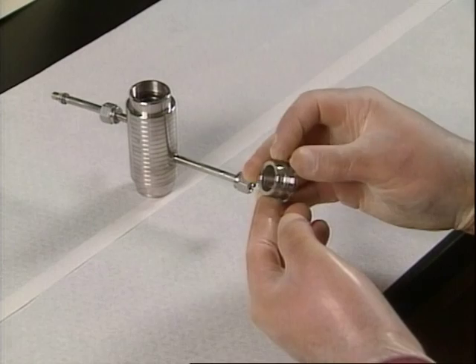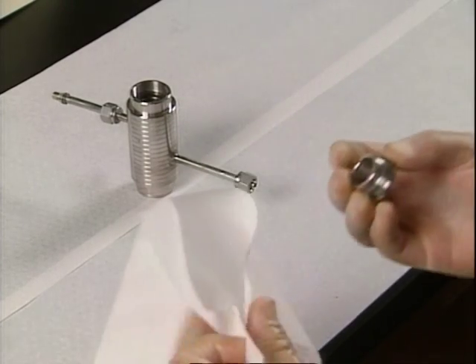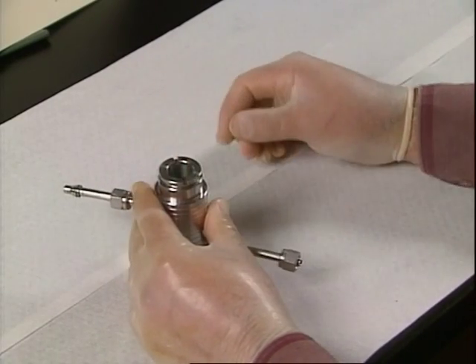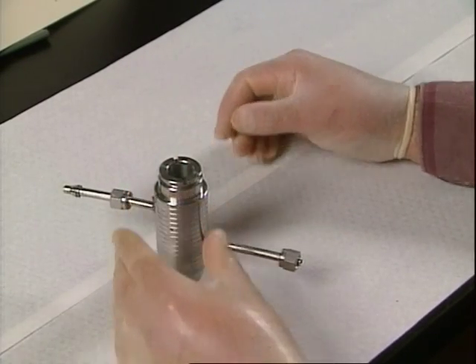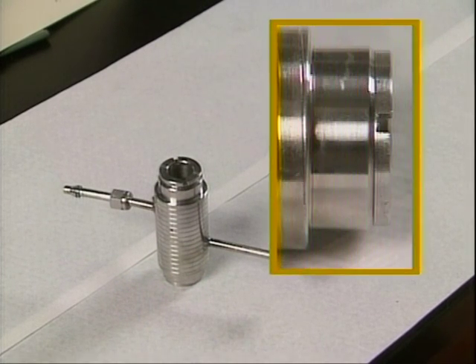The locking ring threads should be lightly coated with a suitable lubricant. Be sure to wipe off any excess. Tighten the ring gradually, pausing to allow the gasket to seat. Continue this process until the metal faces of the locking ring and cell body meet. Be certain that they are fully tight and there is no gap between them.